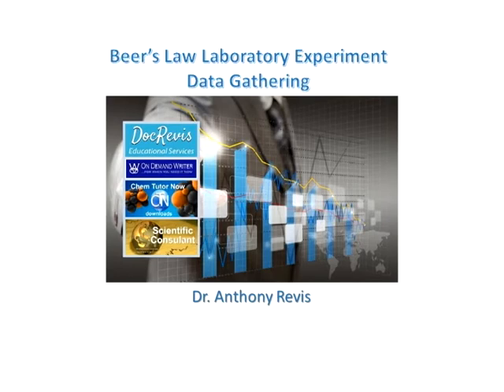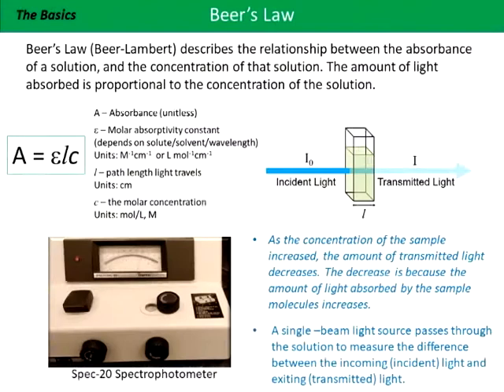Hi, Doc Revis here. In this video, I will show you how to gather data for Beer's Law laboratory experiments. First, what is Beer's Law?